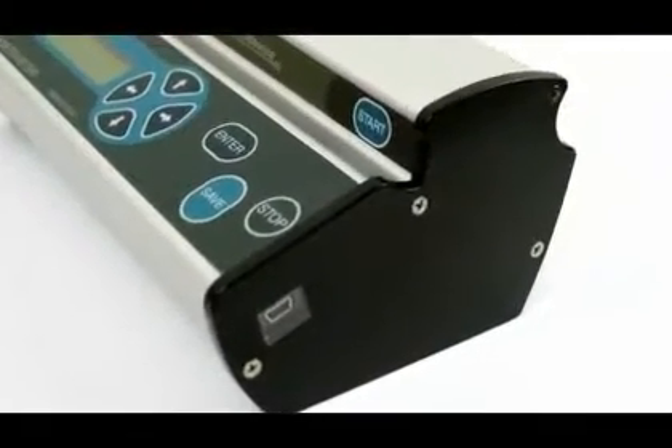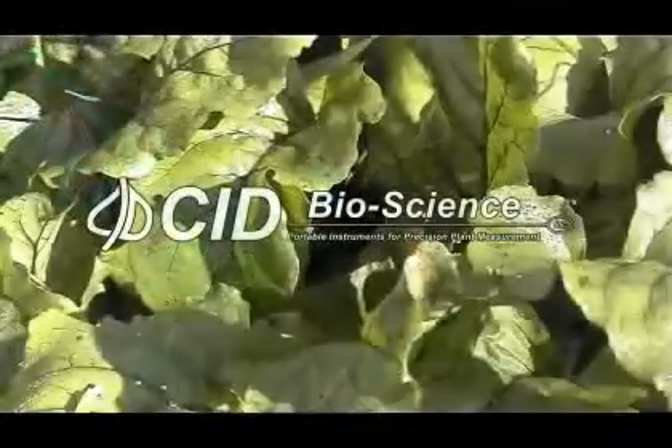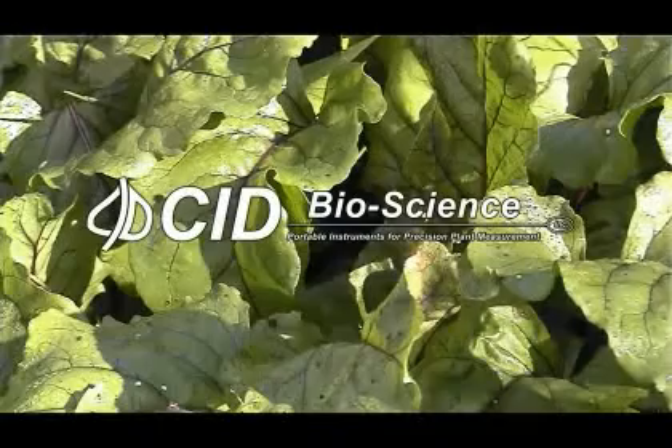A standard USB port transfers data to the computer and recharges the battery. CID Bioscience — Portable Instruments for Precision Plant Measurement.